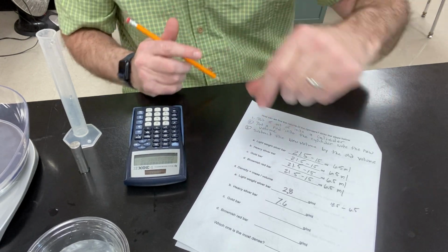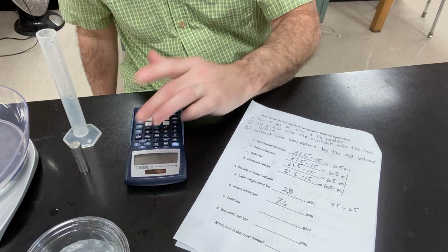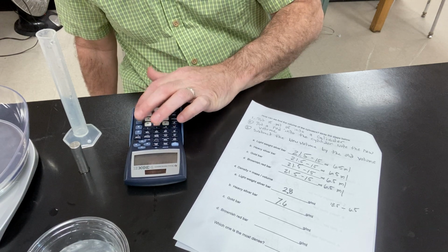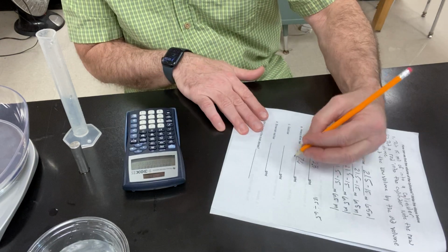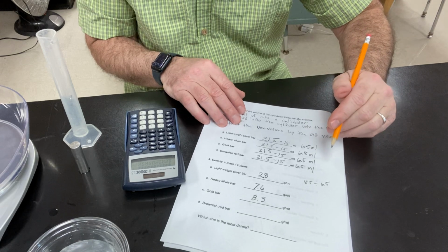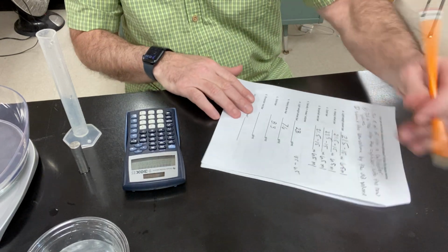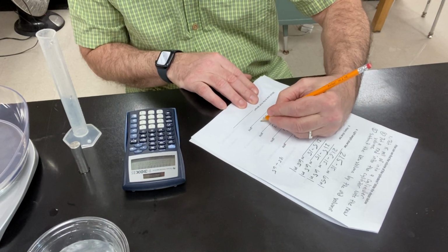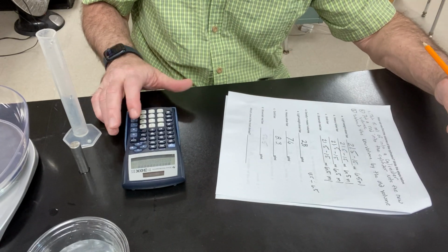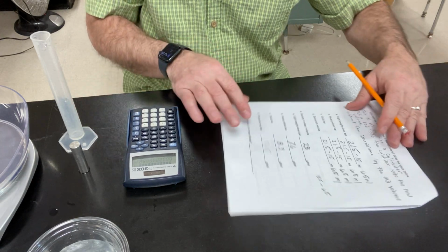Okay? The gold bar, 53.9, so I clear it. And I take 53.9 divided by 6.5 equals 8.29. I'll call that 8.3. Okay? A little bit heavier, a little bit more density. Okay? Next one is the brownish red, which is 56.5. Whoops, what am I doing? That's the mass. Take 56.5 divided by 6.5, and that gives me 8.7.